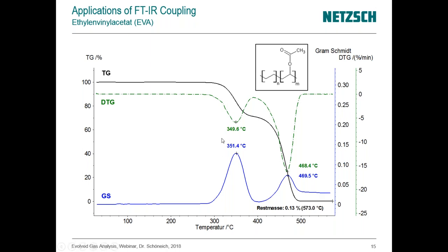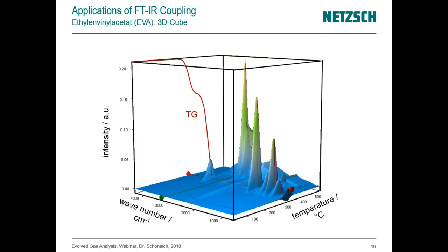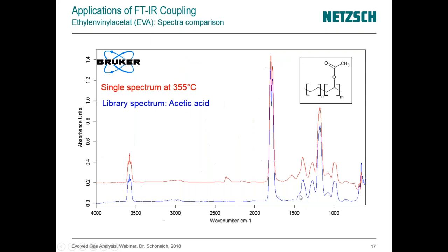To get more information about what is happening — for instance at 350°C — we go to the FTIR data, typically presented as a 3D cube with axes of wavenumber, temperature, and intensity. This cube consists of many continuously measured spectra stacked along the temperature axis. For analysis, we cut this cube at a certain temperature point — for instance, the 350°C region — and end up with an extracted spectrum. We can then compare this against library spectra, and in this case we get a library hit for acetic acid from the NIST database, with quite good correspondence.